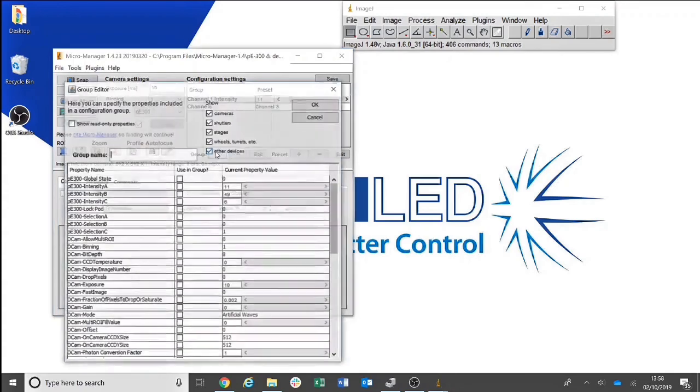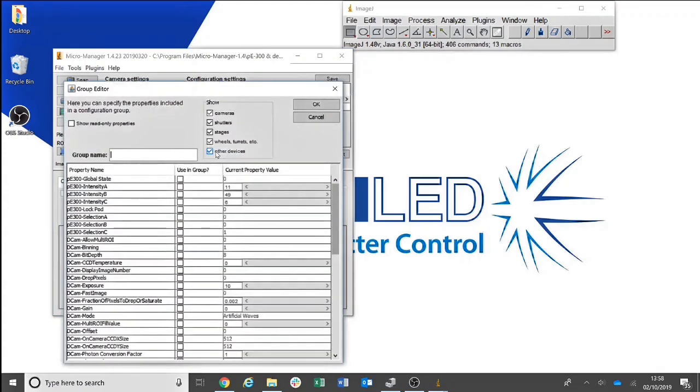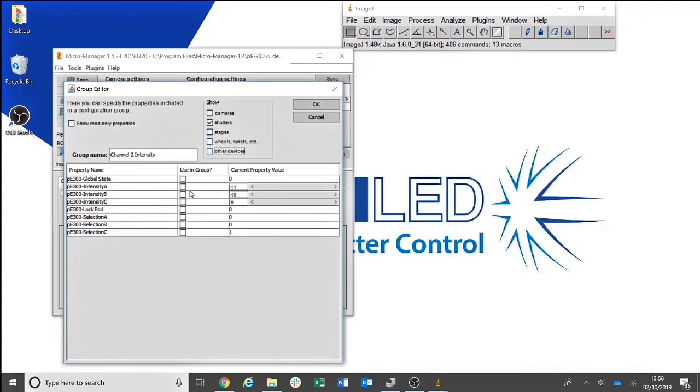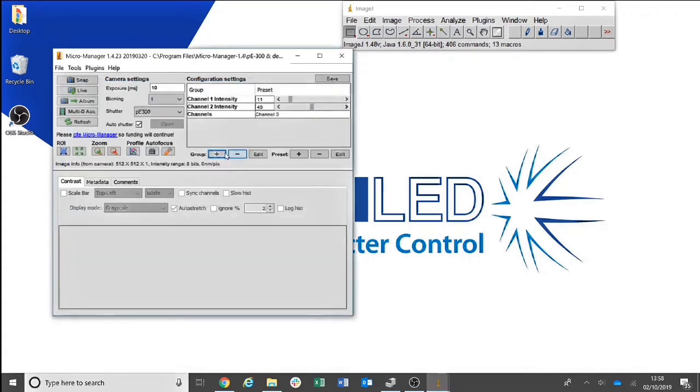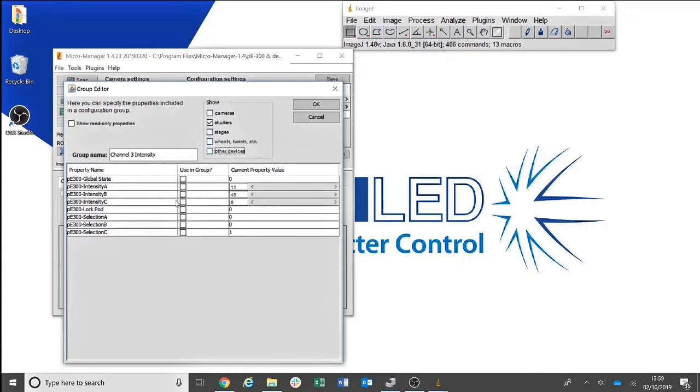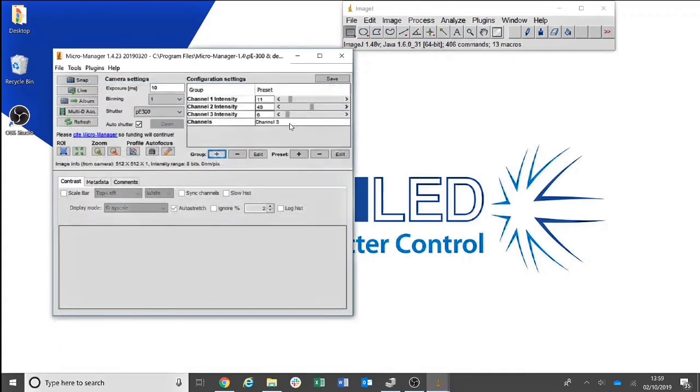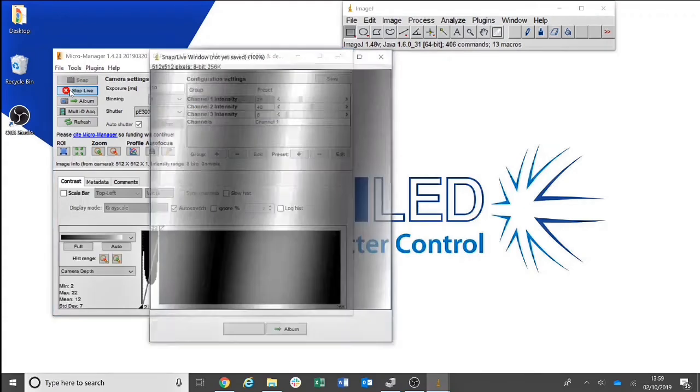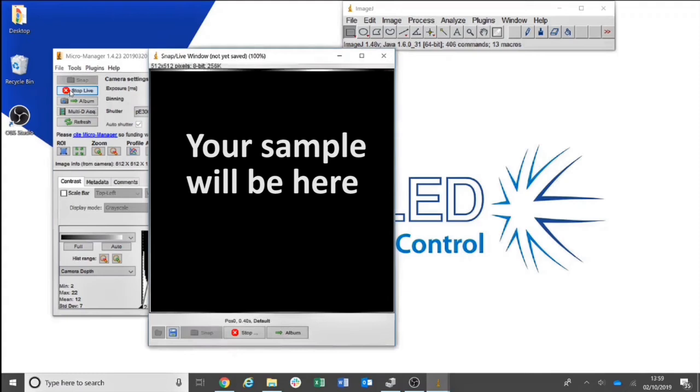We then add another group for Channel 2 Intensity. You can then select the channel you wish to illuminate and the intensity required. If you then click Live, you will see your light source illuminate.